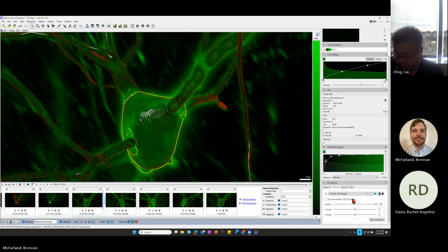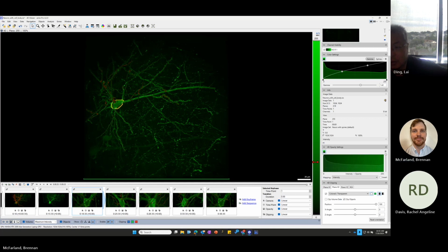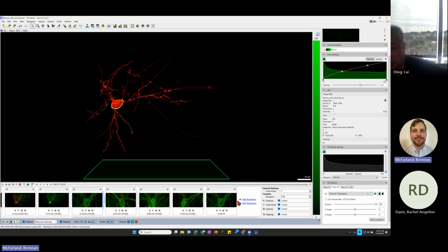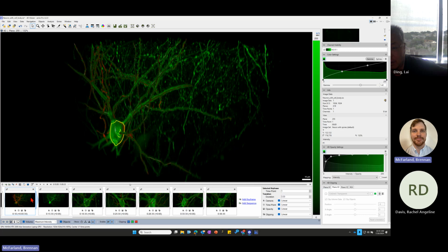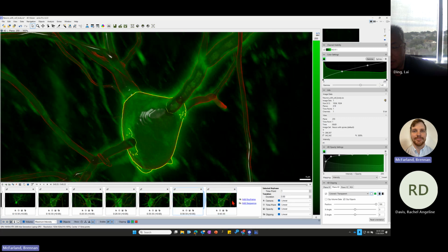So we went over clipping, and just to reiterate, any of the views that we see in here, for example, this data has pretty good contrast, nothing super saturated. If we did something like this, and then we played our whole, wait, do this here, a keyframe.